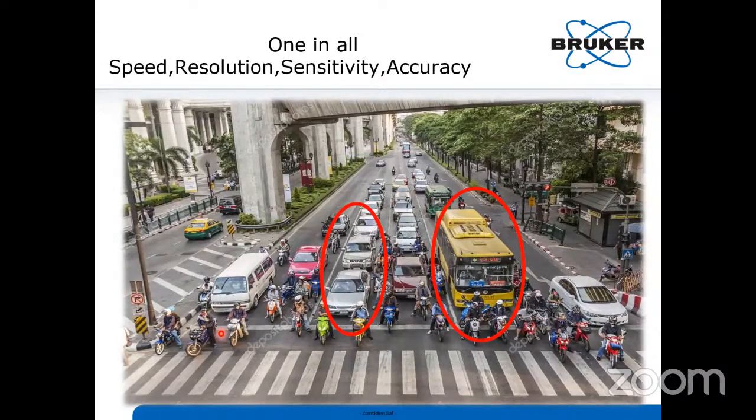Once I release this traffic signal to green, all these vehicles will move at a time. But still, as the detector, you are standing here and you have to check every vehicle. Once all those compounds have moved past this detector, I may come and ask you how many cars you counted, how many vehicles you counted, what kind of vehicles those are, what the specifications are.